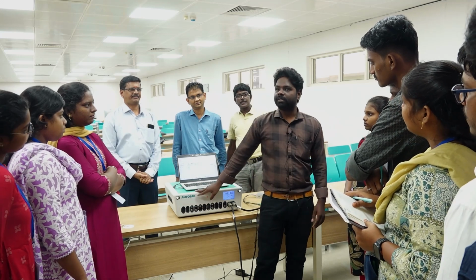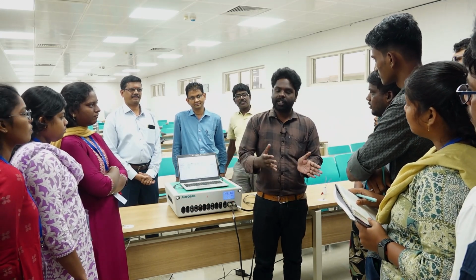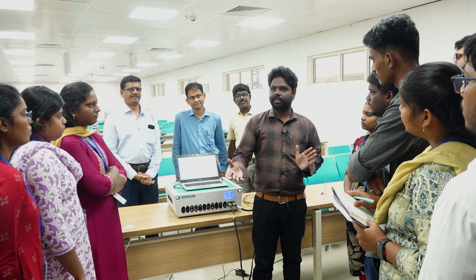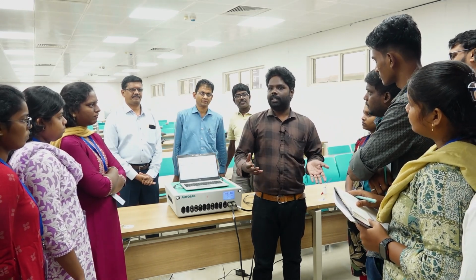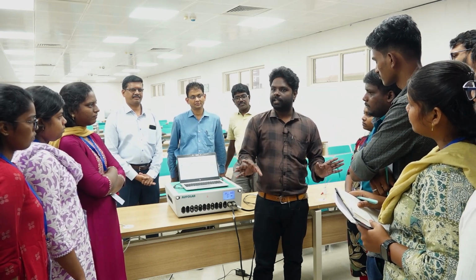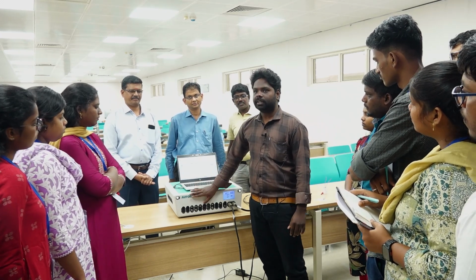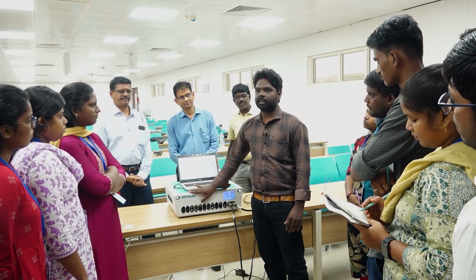Metrohm is one of the global analytical instrument companies. They are involved in different departments: spectroscopy, titration, electrochemistry, ion chromatography. They fabricate different analytical instruments. This is one of the Metrohm products, an electrochemical instrument.